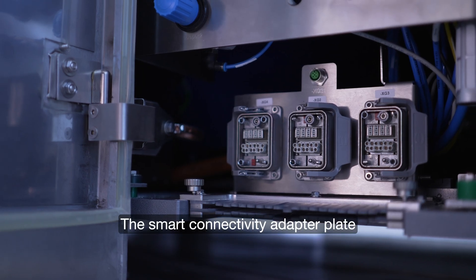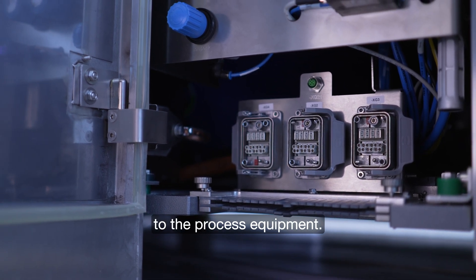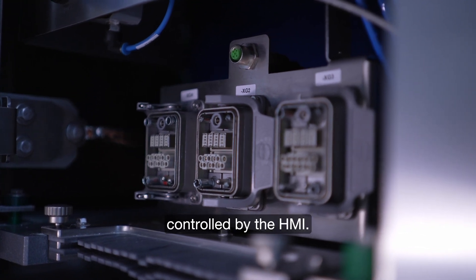The smart connectivity adapter plate makes an easy connection to the process equipment. The process equipment can be easily controlled by the HMI.